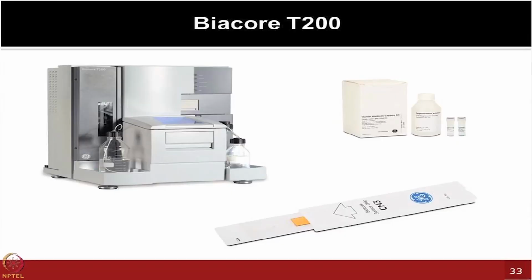The Biacore T200 is right now one of the industry leading technologies, which is pretty much GLP approved. So whatever data you obtain here can be sent for FDA or other kinds of approvals, and that is why a lot of industries are looking for these kinds of technology platforms. Nevertheless, these technologies give you very precise data, but they are very costly, considering how much it costs to do these experiments.